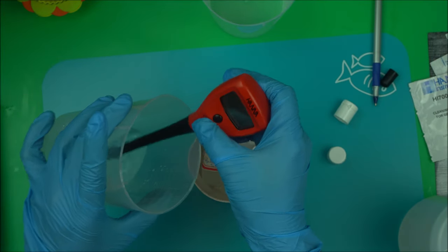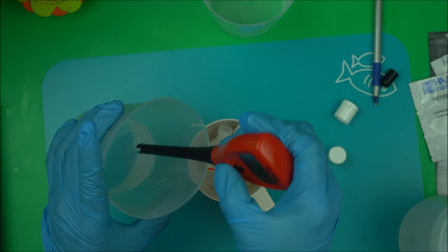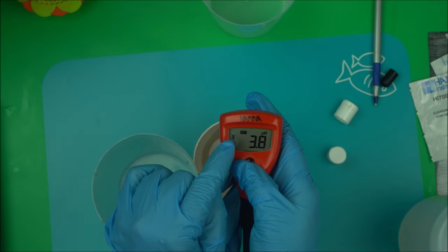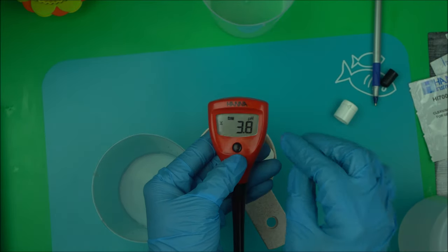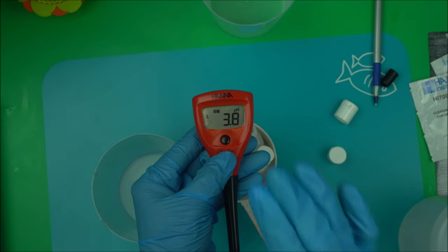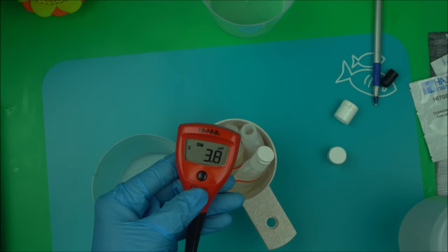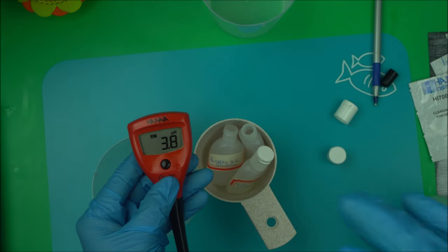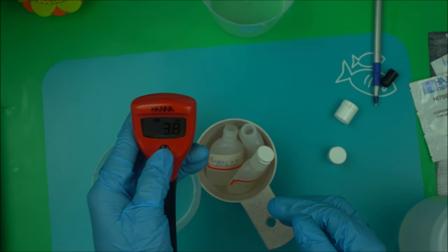Once calibration is done, turn it off and rinse it in distilled water. When you turn it back on, you're going to see both 4 and 7 displayed — that tells you it has been calibrated for pH 4 and pH 7, which is very important for accurate readings. Some meters can also calibrate for pH 10 — just follow the same instructions.